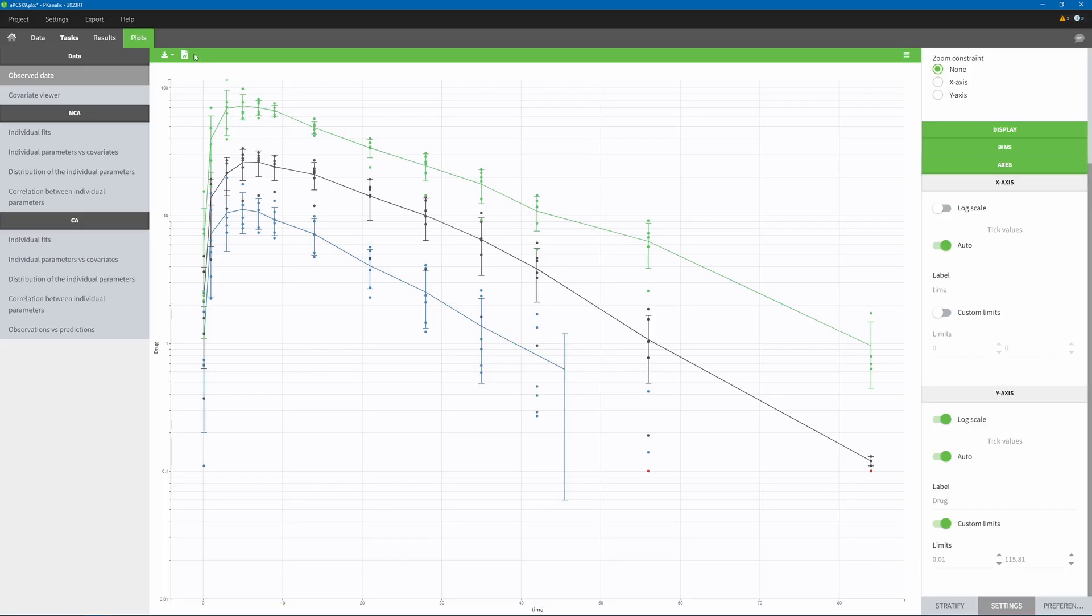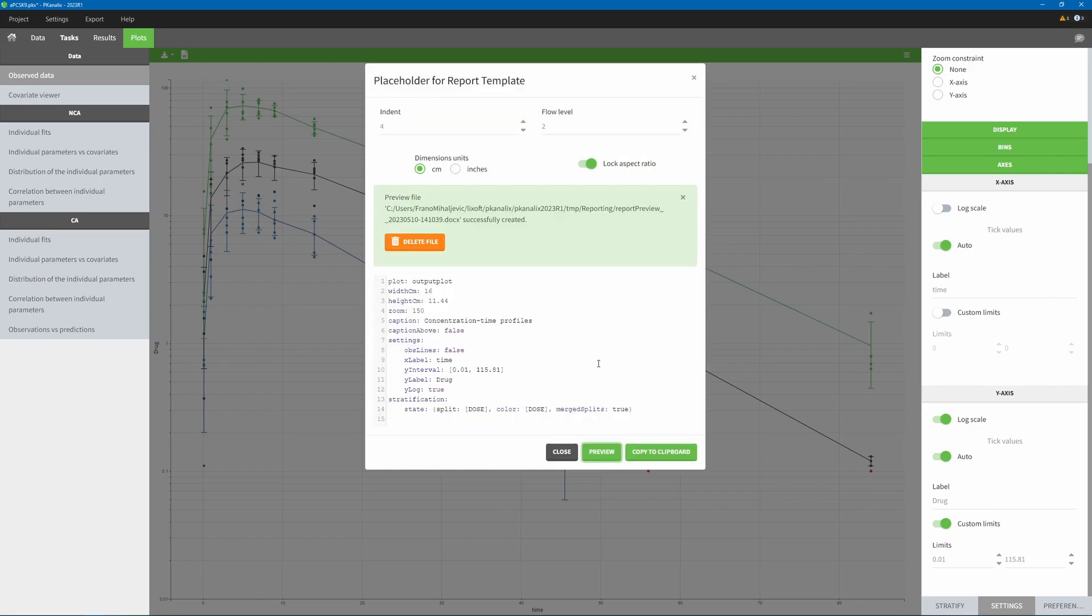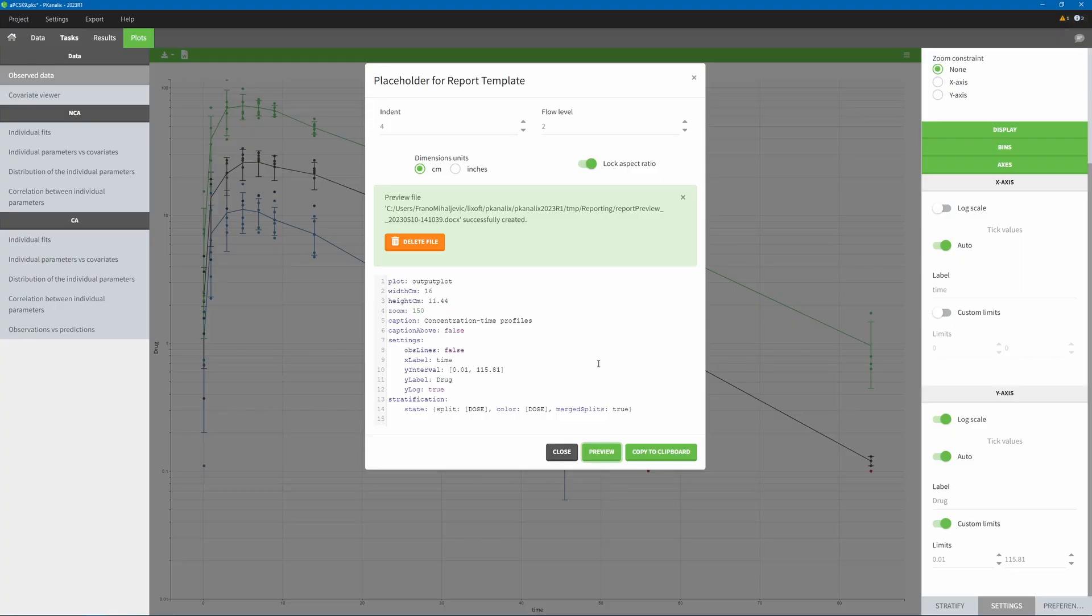You can see the placeholders directly in the interface with this button. In the window that opens, you can easily edit the placeholder settings, for example, to increase the size of all elements with the zoom value, and see the result right away with the preview button. Or copy the placeholder to paste it in your report template. Your template can even include customized table styles or several versions of the same plot with different settings.